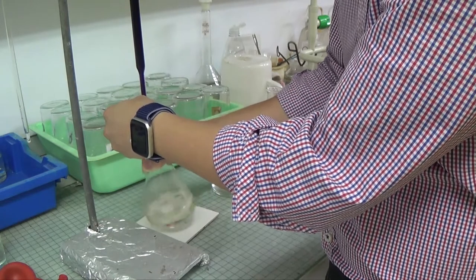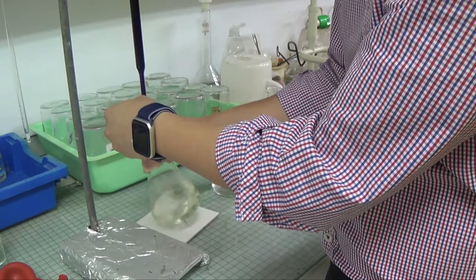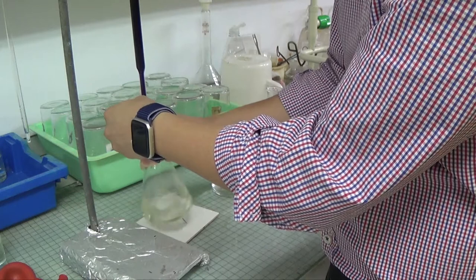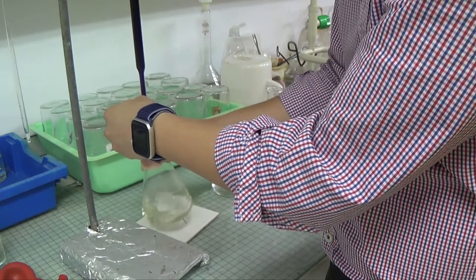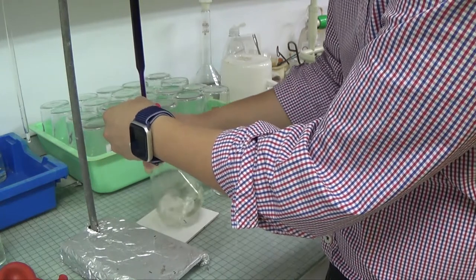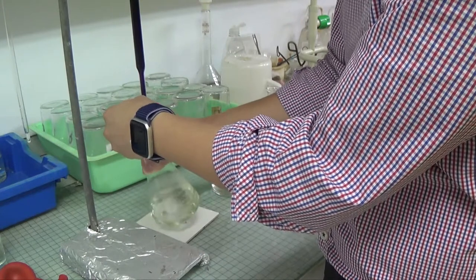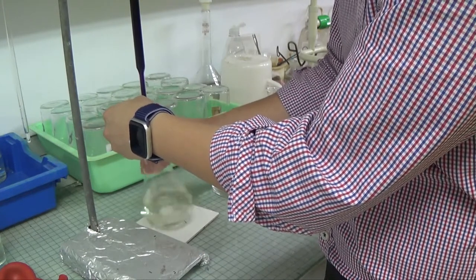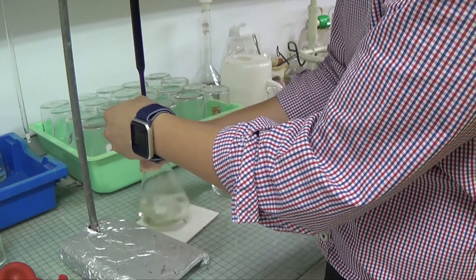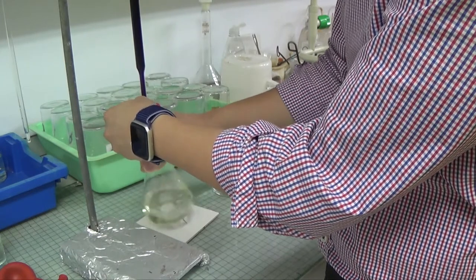So sometimes it's better to just do the rough titration, because some people like to be accurate from the very beginning, and if you don't know roughly where to stop, then you're just wasting a lot of time looking for the accurate titer. But once you know where the rough titer is, then it's easy for you to roughly work out when you should stop for the accurate titer. Oh gosh, this is taking a while. So my hands are getting sore now.